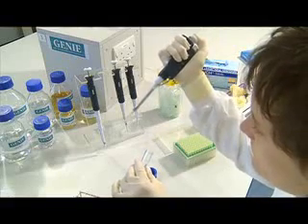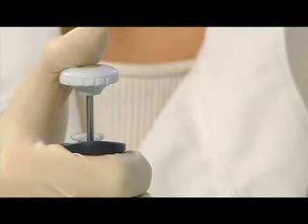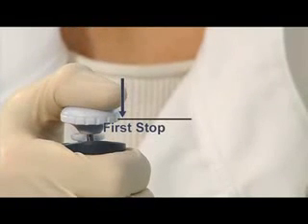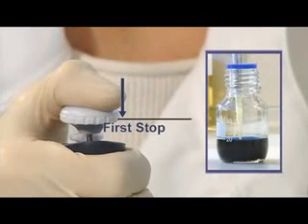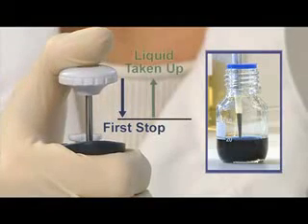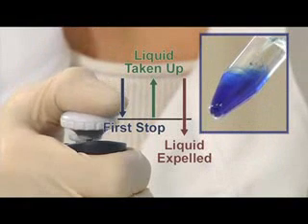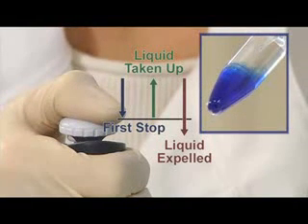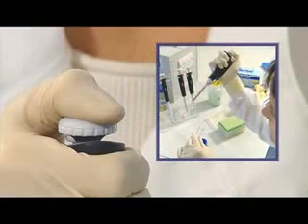Fully withdraw the pipette tip from the liquid before you release the push button. To recap: push down the push button until you feel some resistance, place the pipette into the liquid and slowly release the push button. Release the liquid from the pipette by pushing past the first stop to fully expel the liquid from the pipette tip into the recipient container. Withdraw the pipette from the container before you release the button.